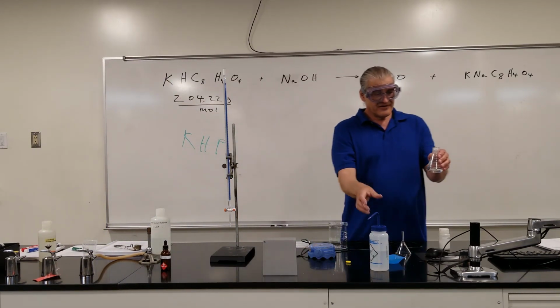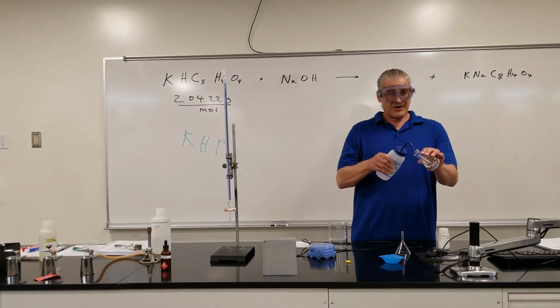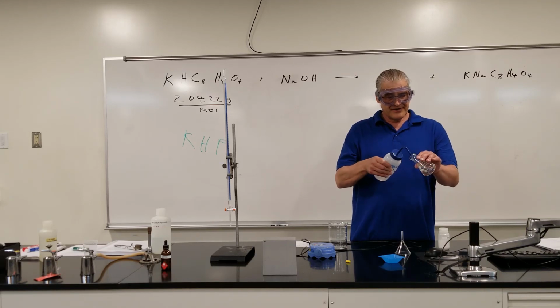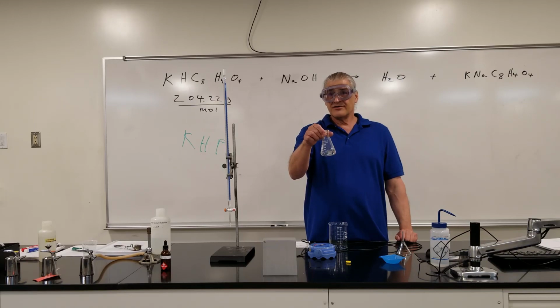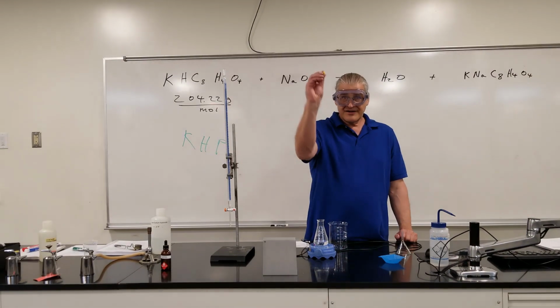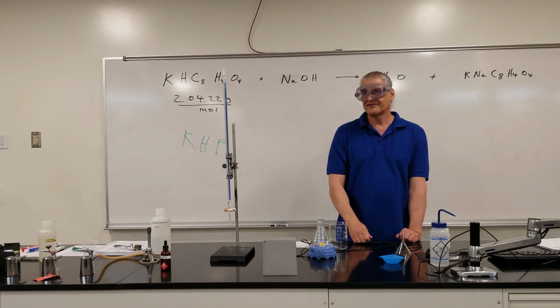In order for this to work well, it helps to add a little bit more water. The only purpose of adding more water here is it gives you a good enough volume for it to stir up. We're going to use a little stir rod in here, and you see how that stirs the solution for me.